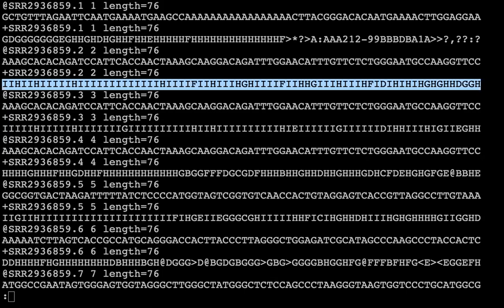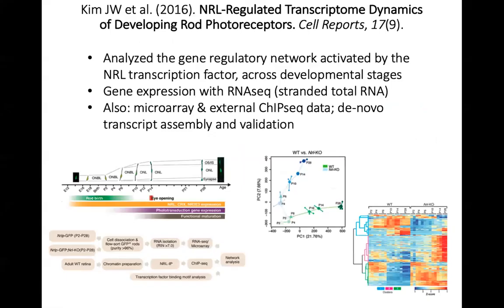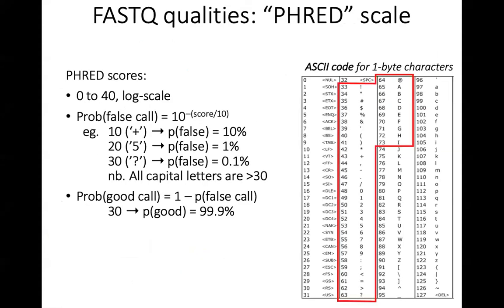Where's, I need to zoom, yeah, this. I can't see it anymore. Oh, it's gone. I don't see my mouse. It's a bit complicated. That one. Okay. So if I go back to this, these are the exercises, and just before that we saw this. These were the slides about qualities.